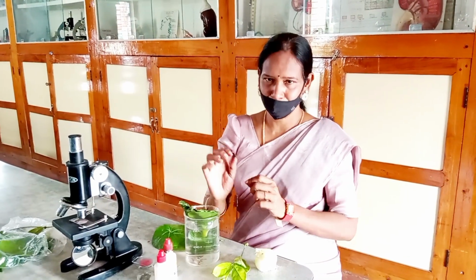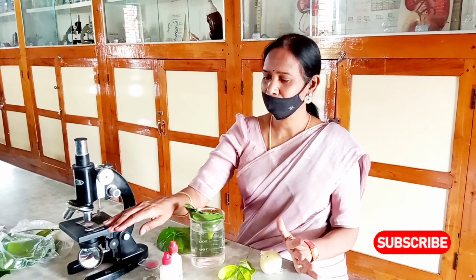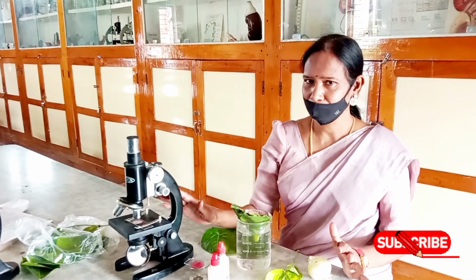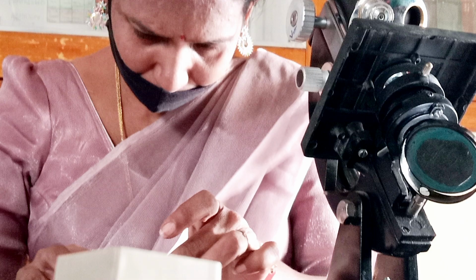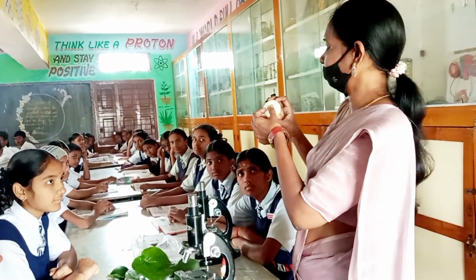You know, all these are brought by students. So today they are going to see microscopic visuals of these particular ones. You too can watch these wonderful microscopic visuals at the end of this video. My students are habituated to sit according to their seating arrangement. I used to have my seat just beside the door because we need sufficient light to be focused and reflected to get perfect visuals. First of all, I explain clearly by showing all these collected materials.